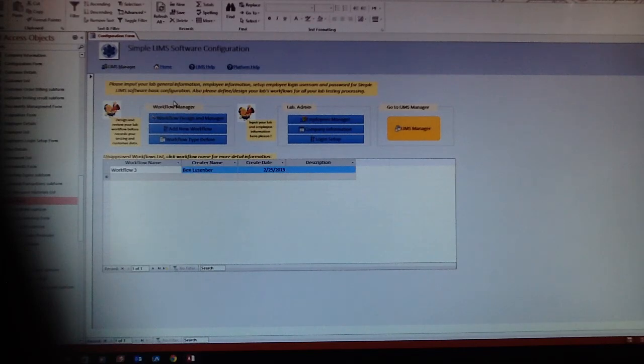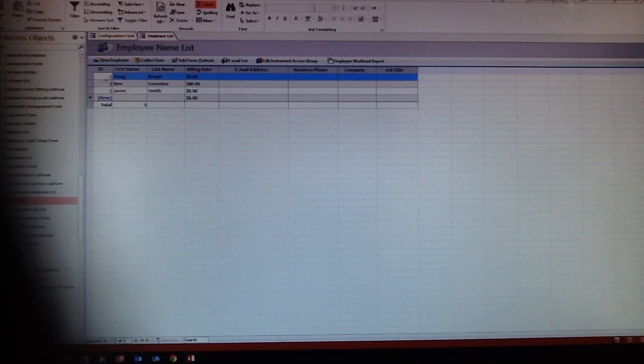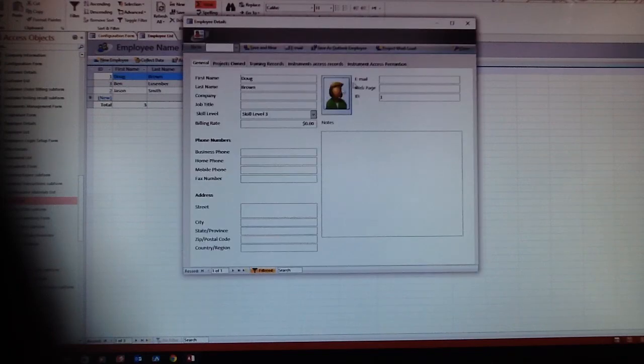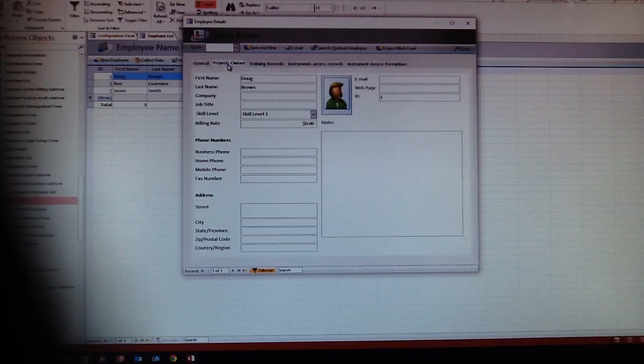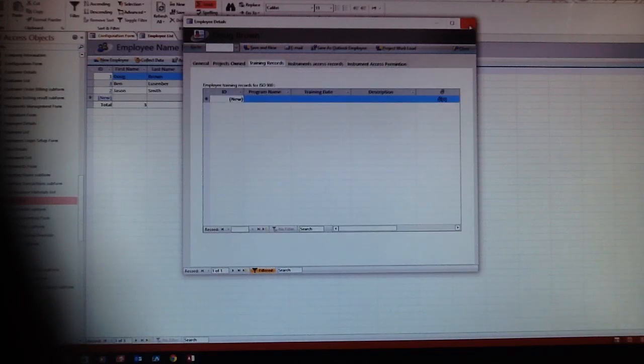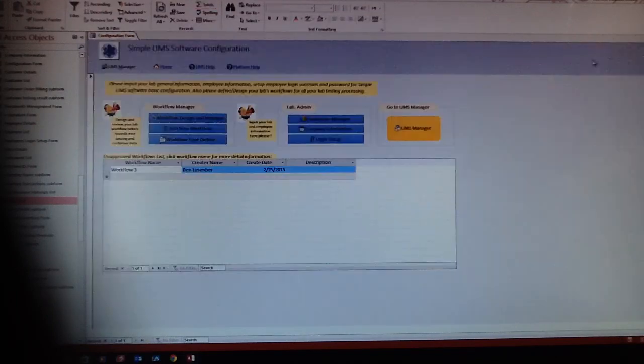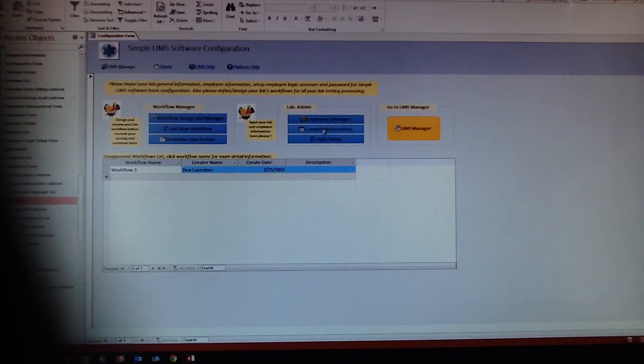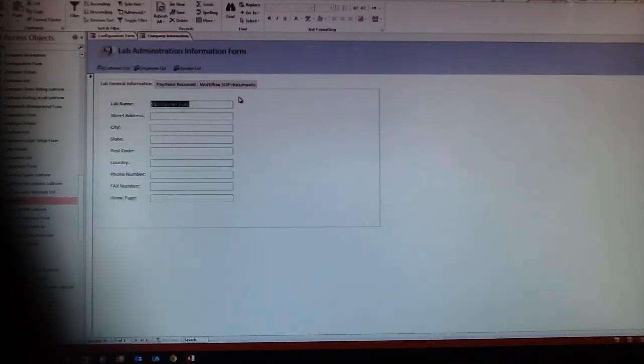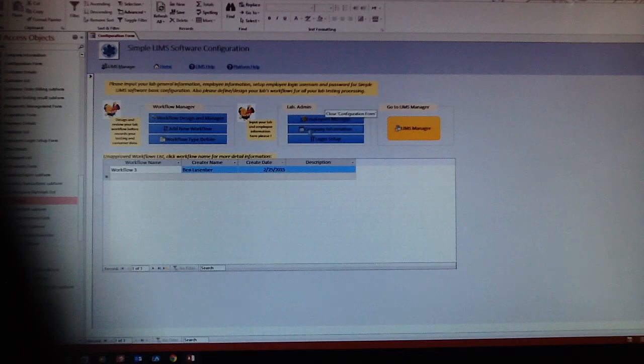We're going to configure two types of things. First, lab information. You have to input your employee's information, employee names, and also useful information like project zone and training. Also, company information like your address, payment received, all those things.